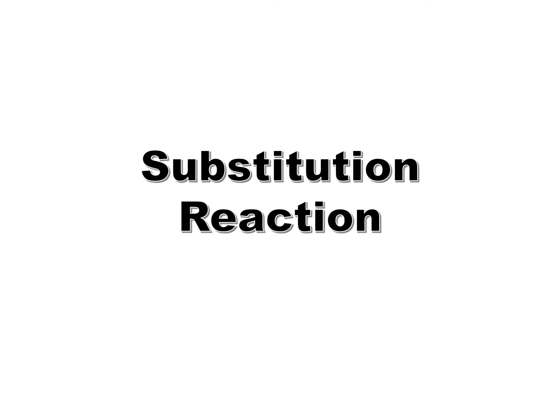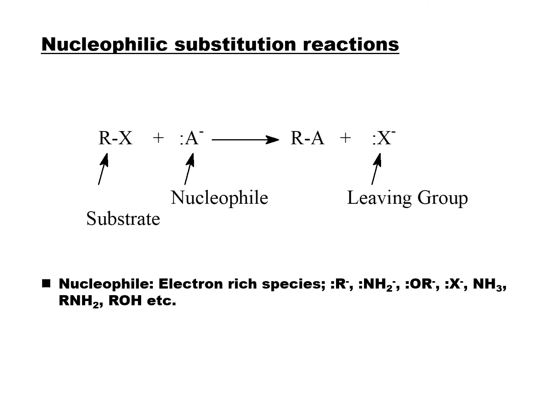And in this experiment, we will be looking at one of the major kinds of substitution reactions. I mean, we have nucleophilic substitution reaction and electrophilic substitution reaction, but we will be focusing on the nucleophilic substitution reaction in this experiment.